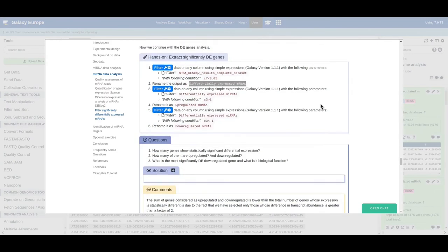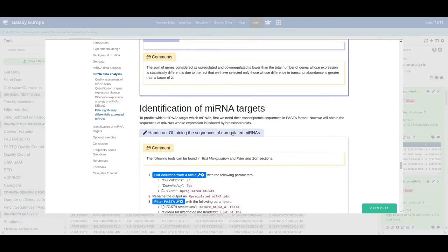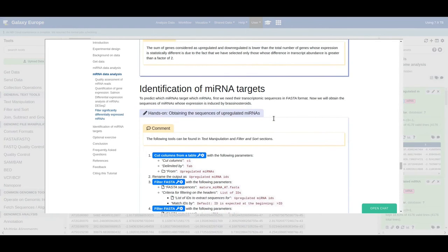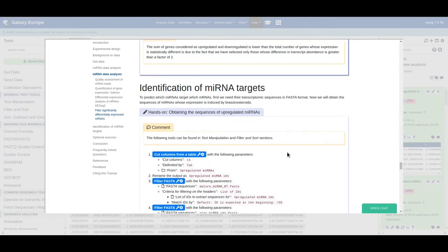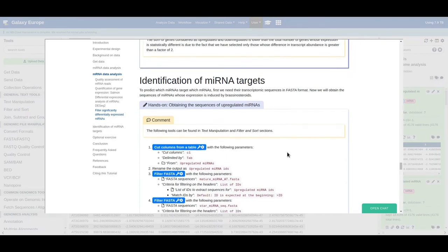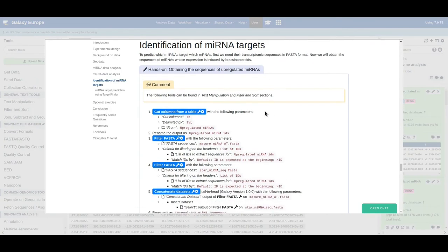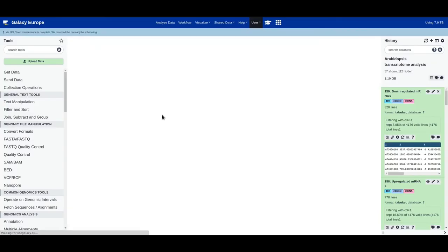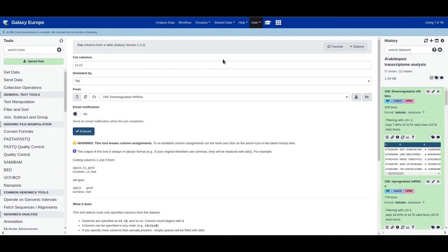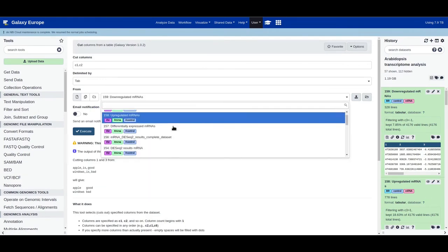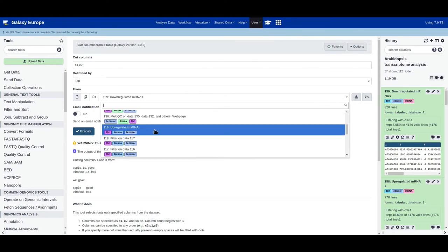Now we have all our upregulated microRNAs and downregulated mRNAs, and it's time to find targets of microRNAs in the downregulated mRNAs. To do this we first need to extract the sequences of the microRNAs and mRNAs — first extract the IDs of the genes, then extract the sequences. Use the cut tool to cut out the first column (C1), which contains the gene IDs from the upregulated microRNAs, and click execute.